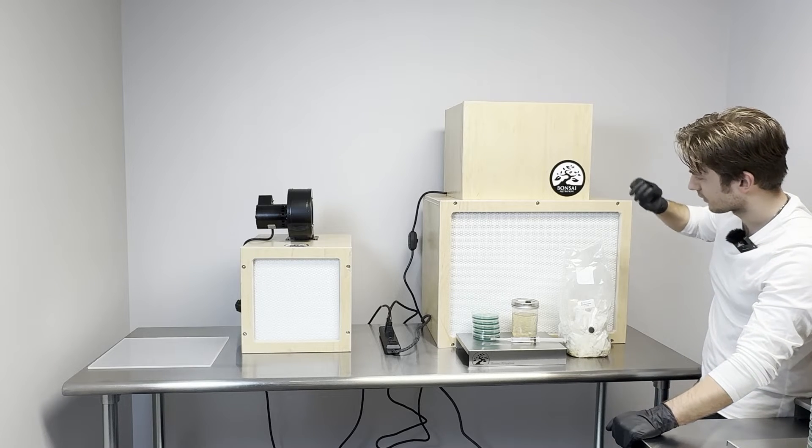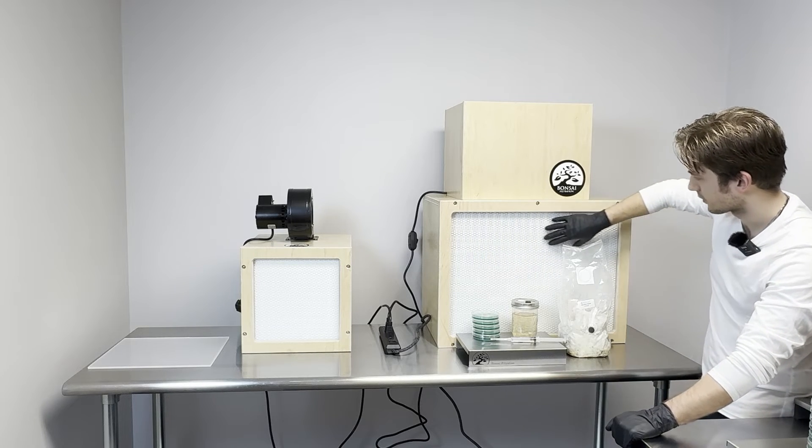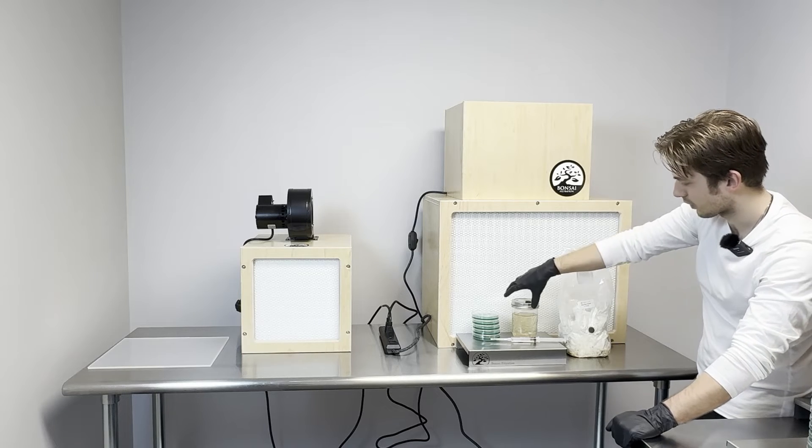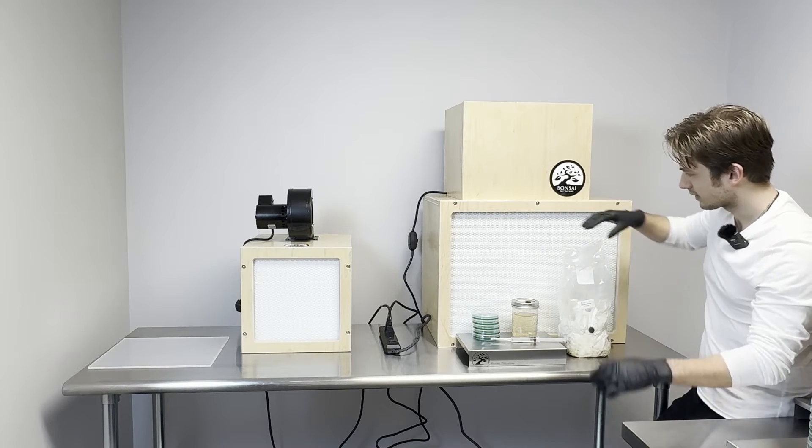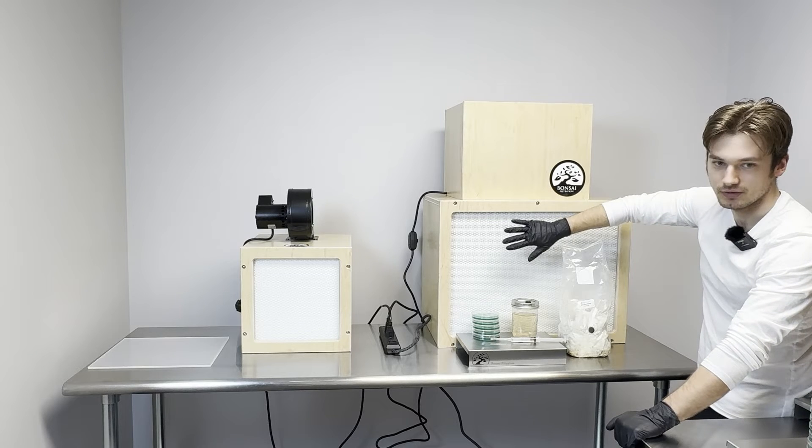Furthermore, the filters are further protected with these bump guards which are neatly placed here. So if you're working and you're not being fully cognizant of what's happening and you accidentally hit it, you're not going to damage the mini pleated filter right behind.